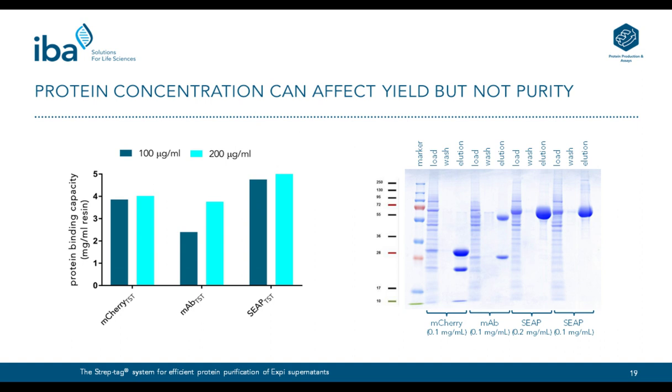2 proteins. Furthermore, the monoclonal antibody has a larger size, so the diffusion into the pores, especially to the inner parts of the core, is slower and maybe limited for this protein size. And that means that the yield for low concentrated samples is reduced. In addition, please keep in mind that we have here only a contact time of 20 seconds, which is really short for an affinity purification process. And if you have a longer residence time, then you would also achieve higher binding capacities.